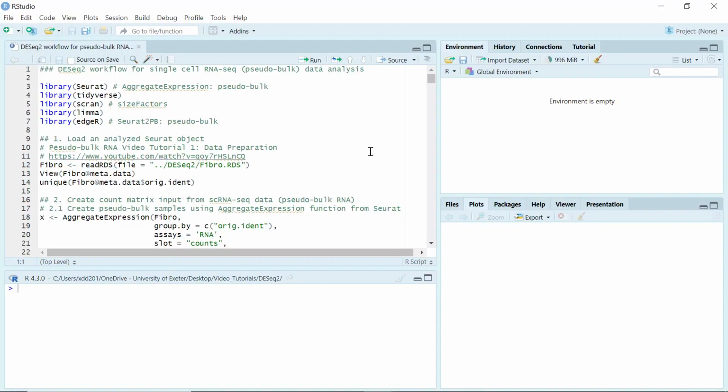Hello, everyone. Welcome to my DESeq2 video tutorial for single-cell RNA sequencing data analysis. To identify differentially expressed genes in single-cell RNA sequencing data, we need to create pseudo-bulk RNA data.